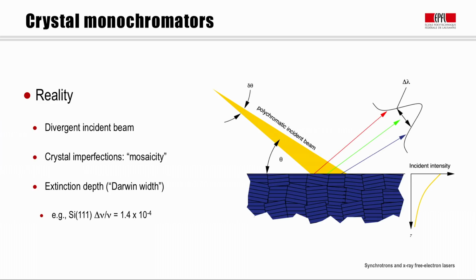Hence, 1 angstrom radiation with an energy of 12.398 kiloelectron volts has a minimum bandwidth of approximately 1.7 electron volts. Note that the corresponding width in theta, the Bragg angle, is delta lambda divided by lambda multiplied by the tangent of theta, and thus the crystal also accepts a fine angular range of the order of 1/1000th of a degree.